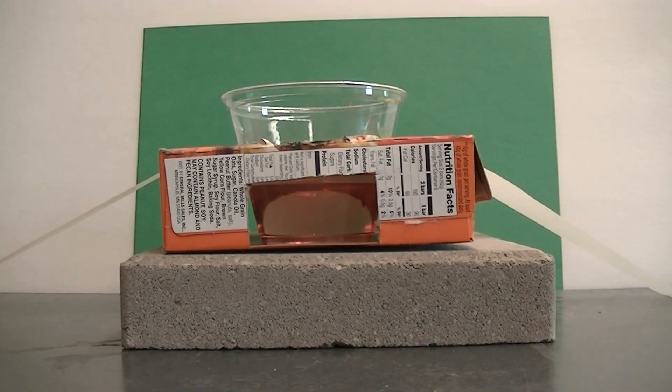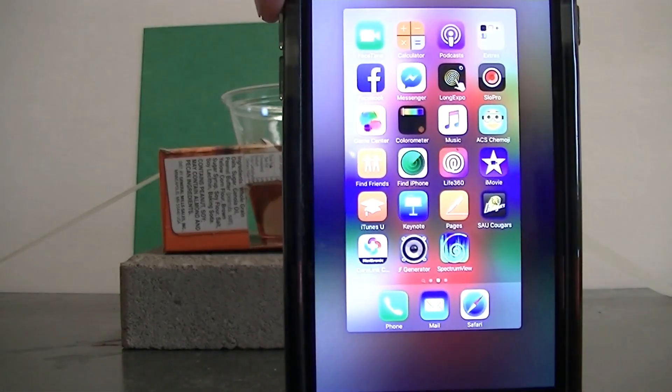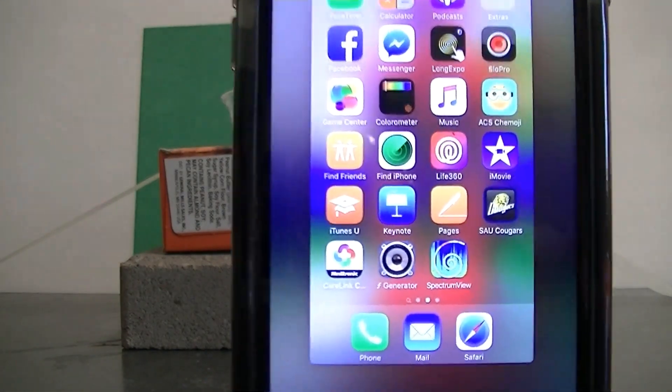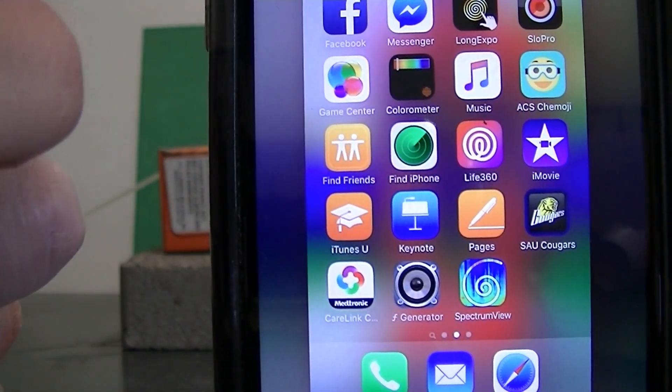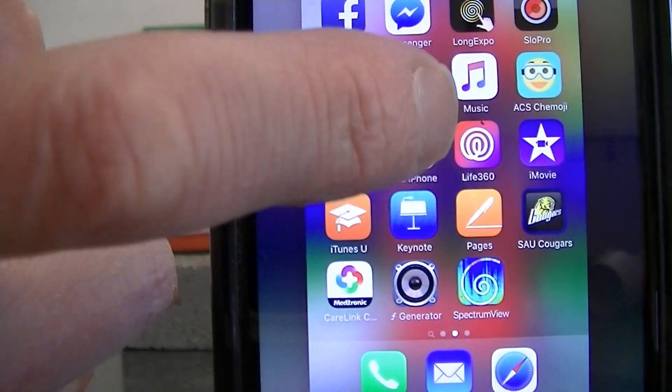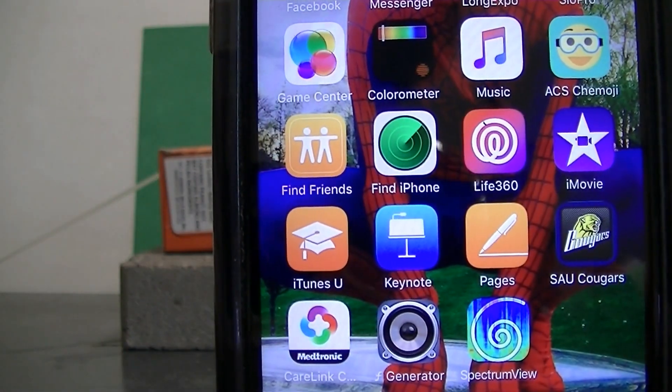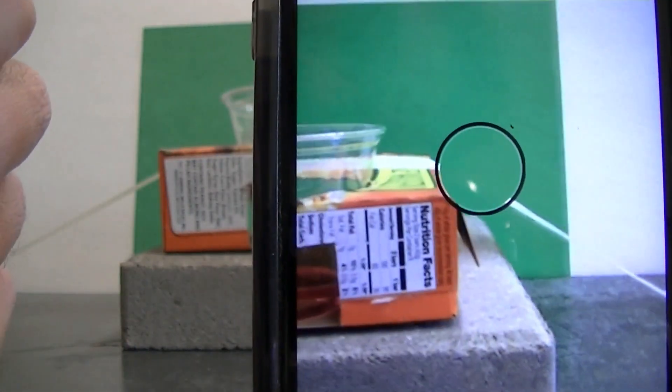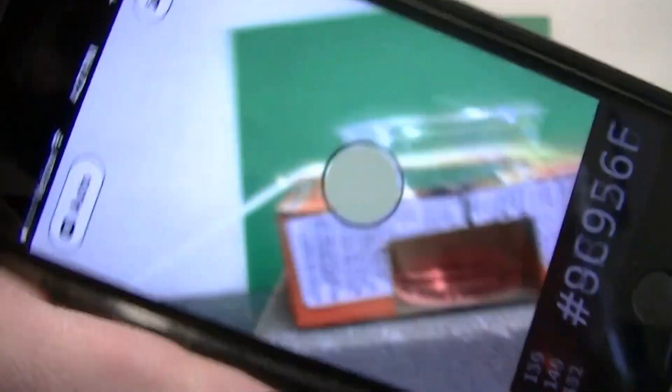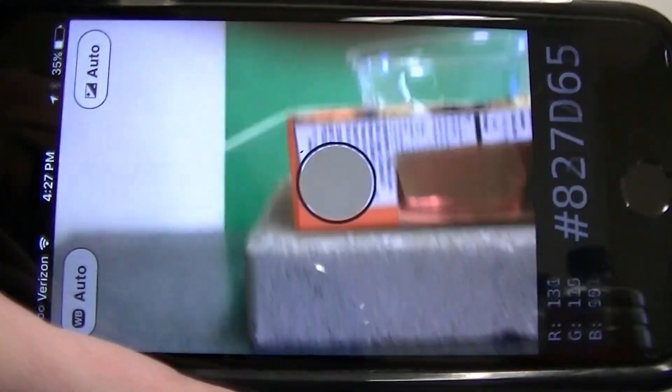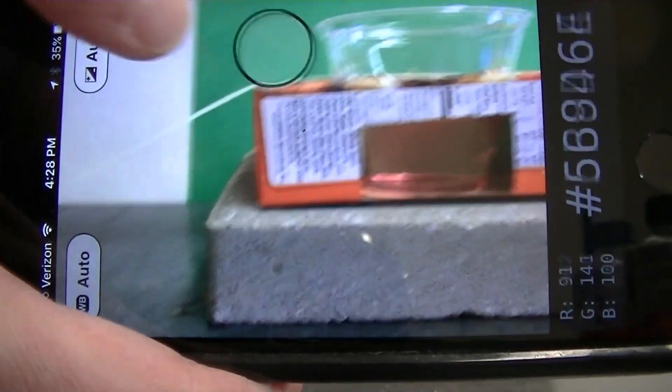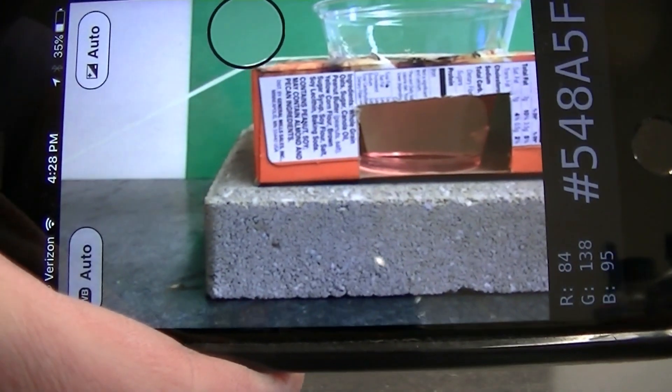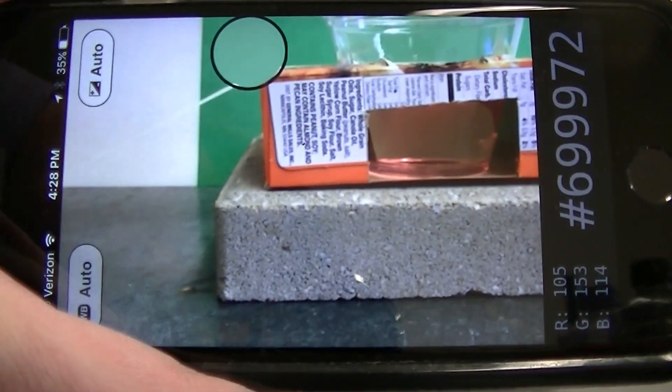Now I'm going to show you how to set up the cell phone as your detector. I'm using an iPhone and there's a particular app on the iPhone called Colorometer that works very well for this purpose. I'm going to go ahead and open Colorometer and when I do you'll see that there's a screen that shows up and I can move this circle that you see just by tapping the screen. I'm going to go ahead and tap it here so I'm getting a lot of the green construction paper in the view.